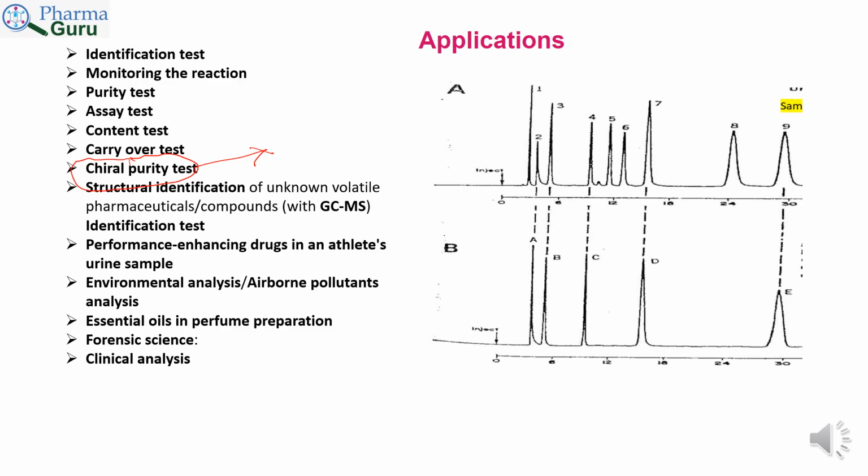For identification test, a standard containing all the impurities or component is injected.